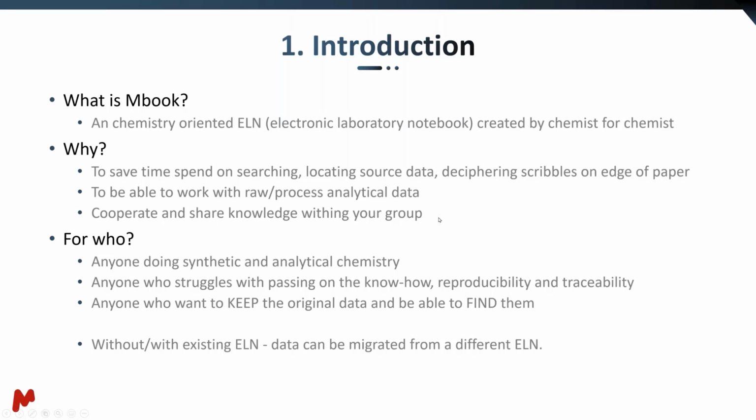And the third why is to be able to cooperate and share your knowledge, because science is not doable by one person, so you need to cooperate, you need to exchange knowledge and share knowledge.